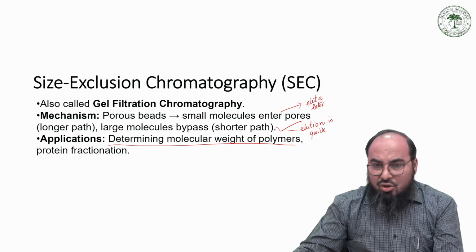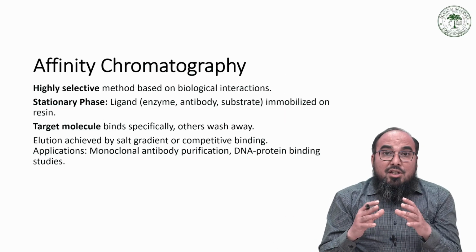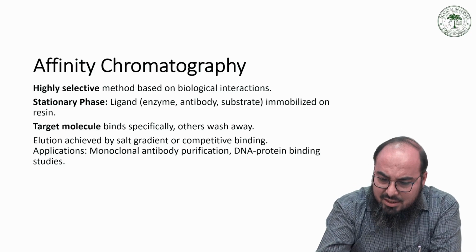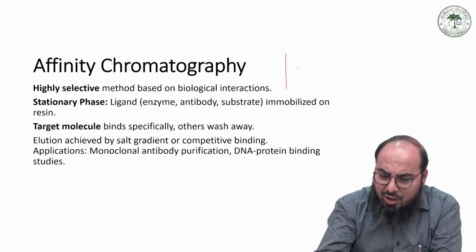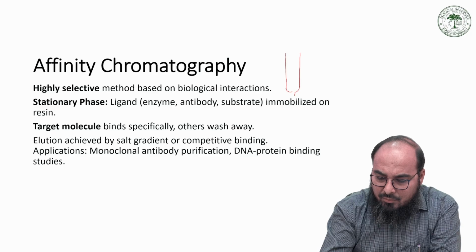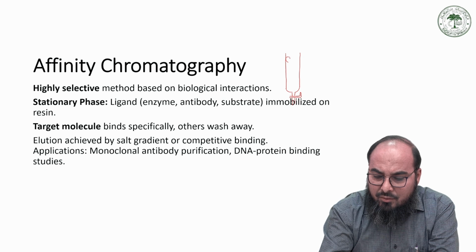Now comes affinity chromatography. This type of chromatography is very good for the separation of biomolecules. What happens is that, for example, if you have a column, and this column is made up of a specific type of ligands.